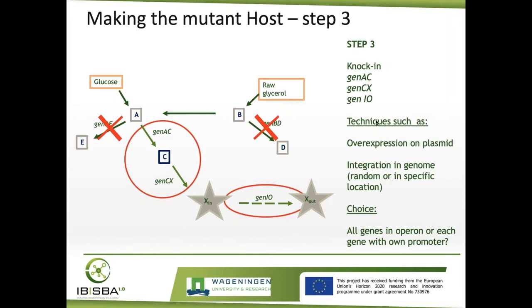We need to make a number of choices, whether all genes are in an operon or each gene has its own promoter. This is all types of, let's say, little design steps that one has to have within the build process.